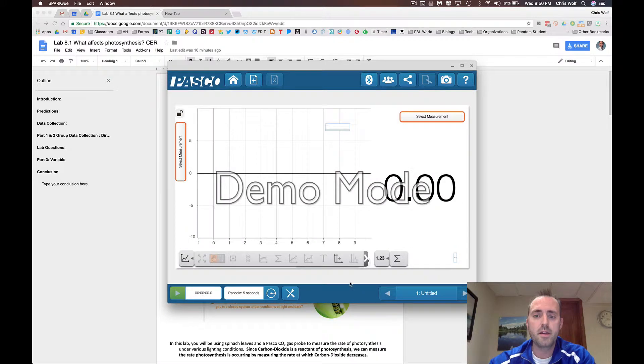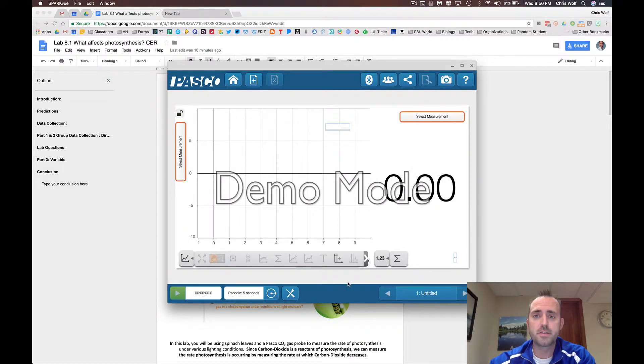Click OK and you're ready to start your lab. Don't forget to let the CO2 sensor get used to the light conditions for 60 seconds before you hit this play button.